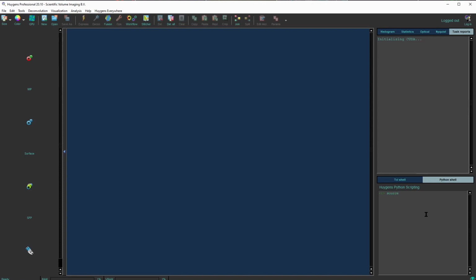So in order to load that script, we can simply specify the path like this. And let's see where it is. Yes, I call it menger.py because it will generate a Menger sponge. Don't worry about the syntax for now because we'll be going over that later.